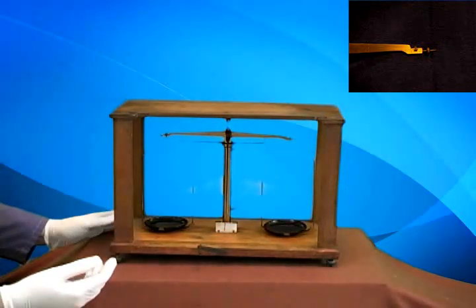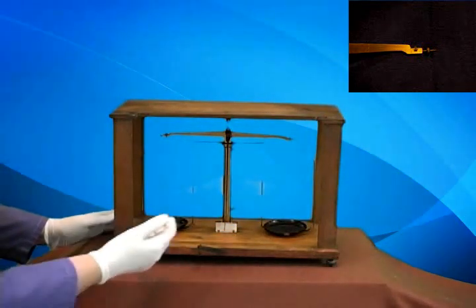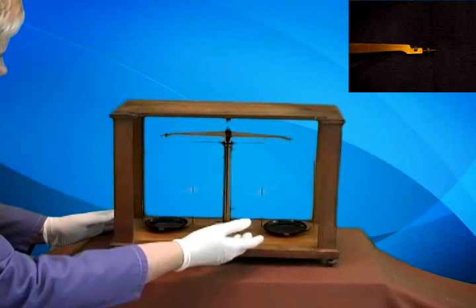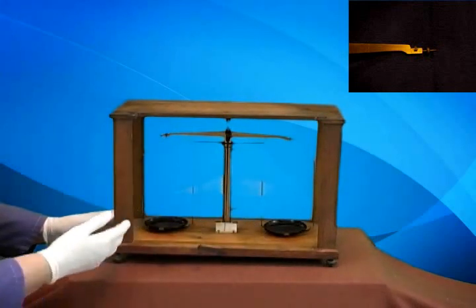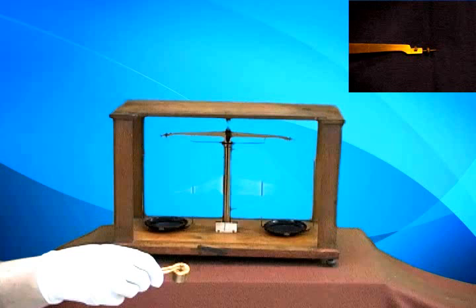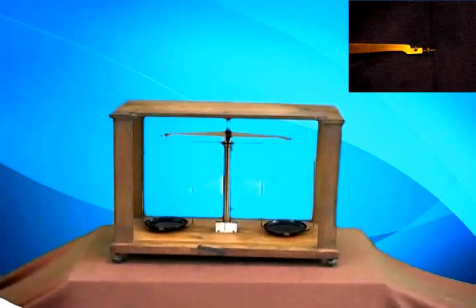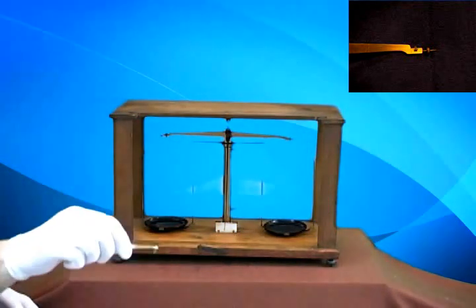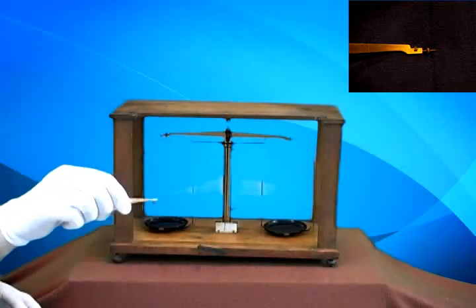They would then place the item to be weighed on one side and the weights on the other. Now, the weights generally ran from something like 500 grams, like this, down to very small ones, like possibly one gram, like this tiny one right here.